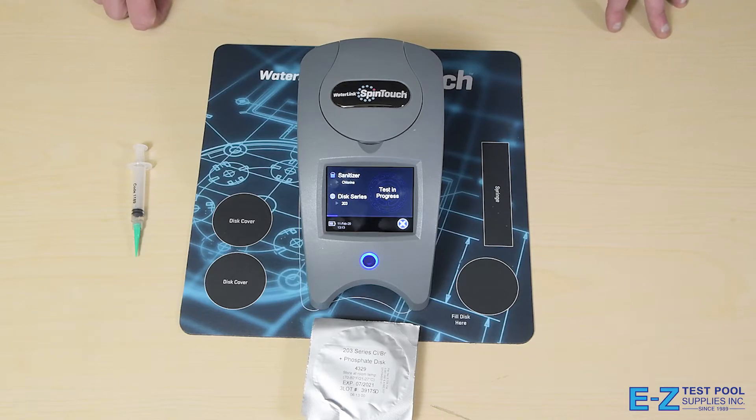Your free chlorine, your total chlorine, pH, alkalinity, calcium, cyanuric acid, salt, phosphates, and iron and copper. This is great as it will allow you to test all of these different parameters within 60 seconds, while a traditional drop test kit will take easily 20 minutes to test any of those other parameters.